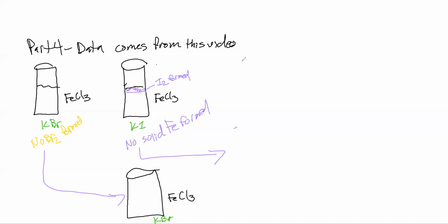We allowed those to mix. But this time, instead of adding hexane to see what our response is going to be, we're adding something else. We're adding in potassium ferricyanide.